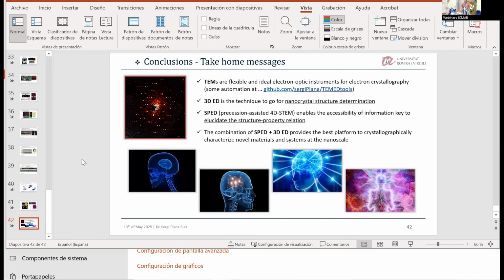And is there any microscope around that can do this? From the many new microscopes, what is around? I mean, in Spain. I'm not sure. Lorentz microscopy? Yes, in Zaragoza. Okay. And is it possible to do it for STEM? I don't know, because to do Lorentz microscopy with a STEM. For this STEM and Lorentz microscopy. Well, I understand that to image magnetic domains in STEM, you need a Lorentz lens.